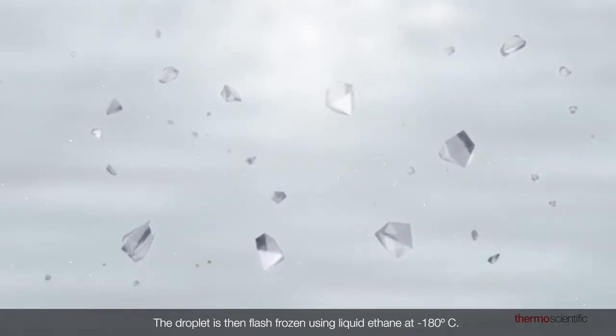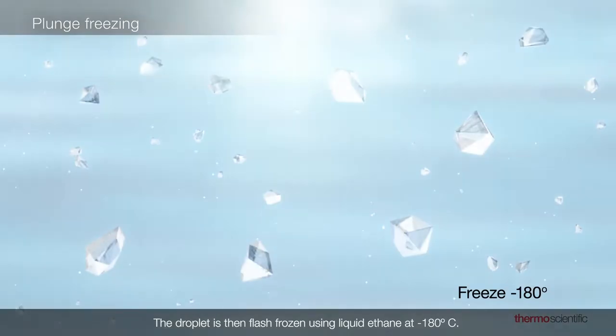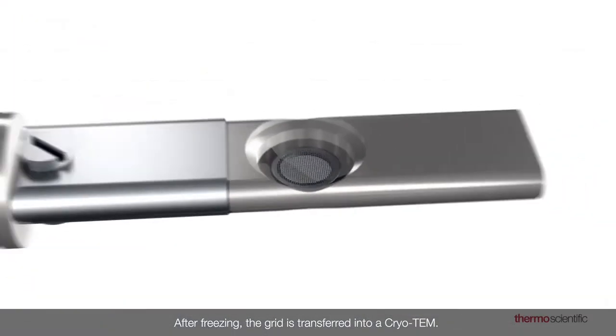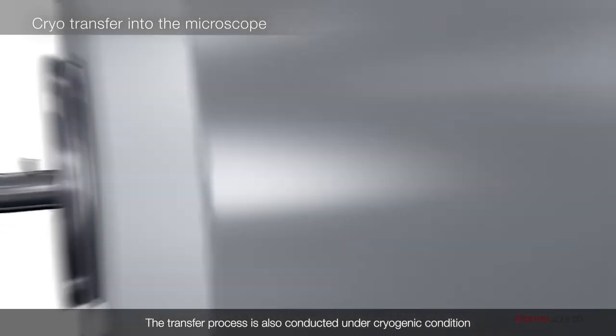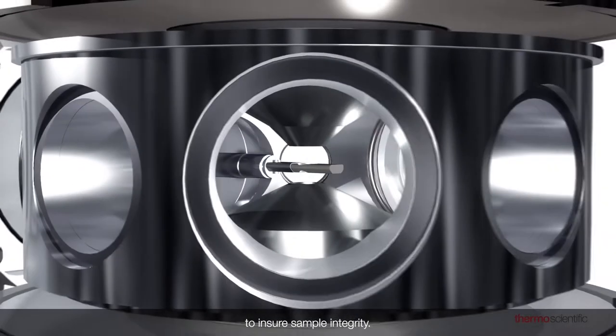The droplet is then flash frozen using liquid ethane at negative 180 degrees Celsius. After freezing, the grid is transferred into a cryotem. The transfer process is also conducted under cryogenic condition to ensure sample integrity.